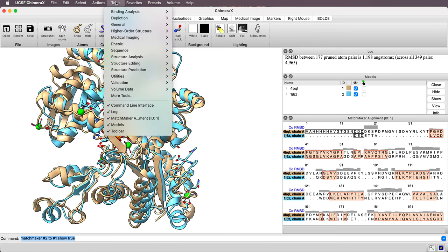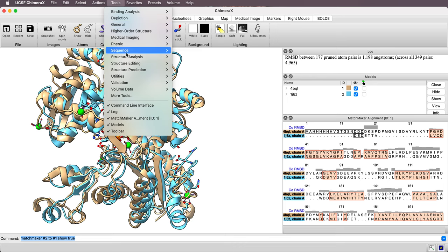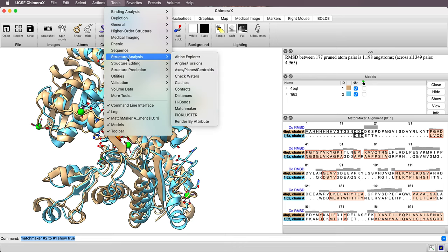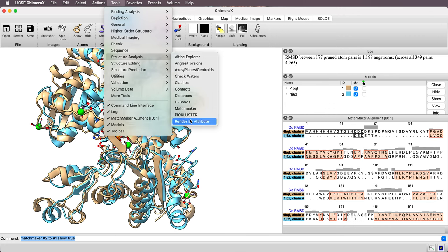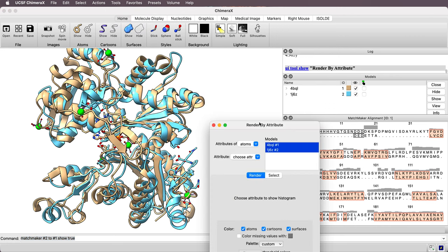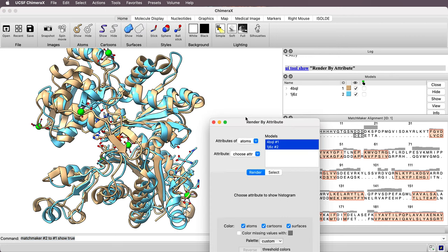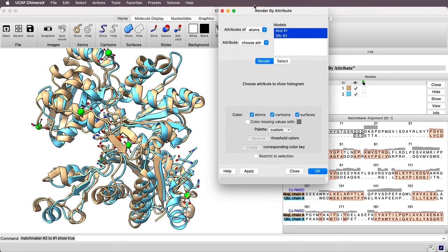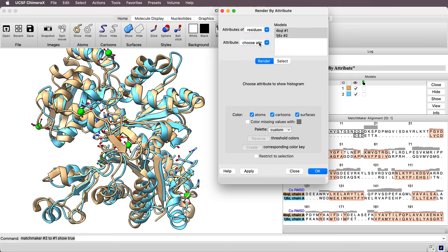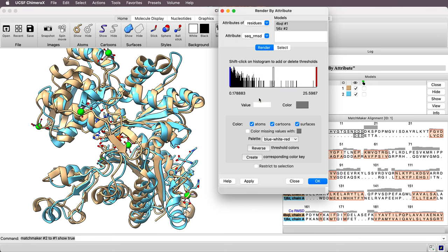So to do that, I'll go to Tools, Structure Analysis, Render by Attribute. So that will bring up this new panel. And I'll say I want the attribute of Residues. And the attribute is called Sequence RMSD.